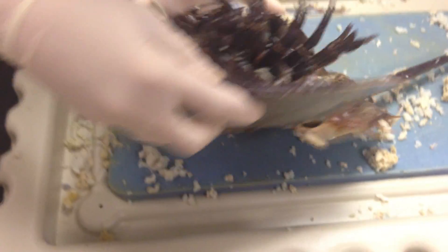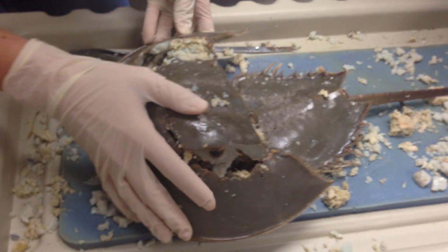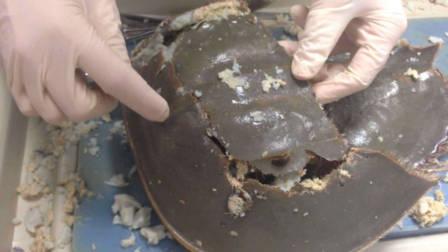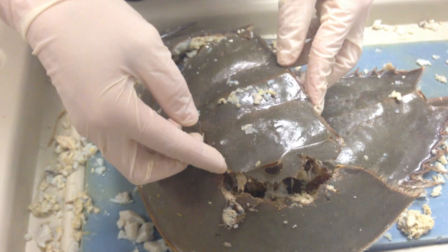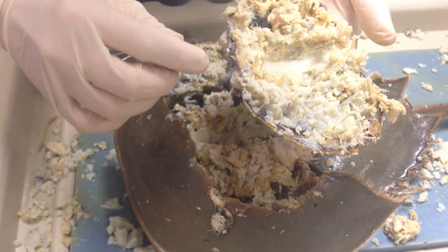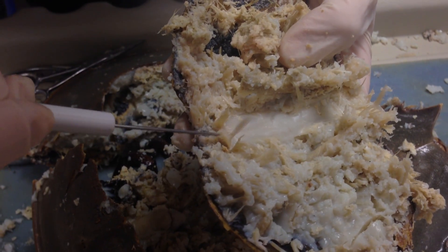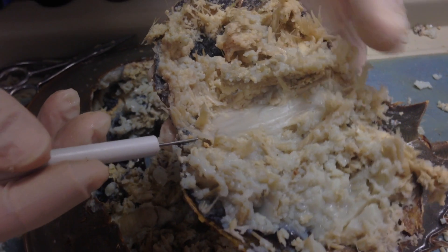We're going to flip this organism back over and take a look at what the insides look like now. We have the medial eyes and the lateral eyes, the lateral ridge and the medial ridge. When we cut this organism open and remove this, you see this nice white structure along the top right here. If I insert my probe into this area, this is the heart of the horseshoe crab.